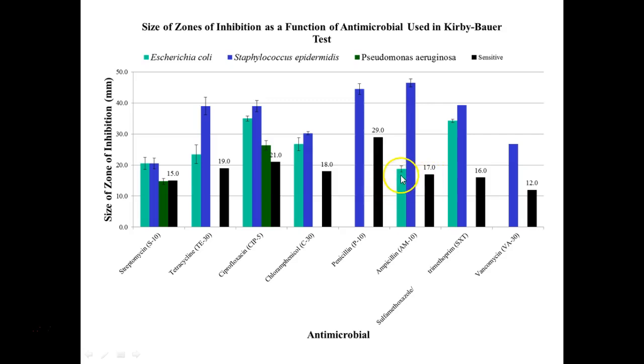And it is sensitive to ampicillin. E. coli is sensitive to, I can't even say this big a long name. But it is resistant to vancomycin, E. coli. Gram-negatives are.